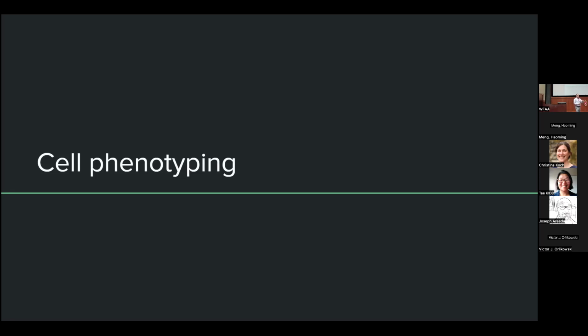And now I'm going to describe one experiment that is still ongoing for cell phenotyping. Cell phenotyping is the second part of the problem. If you remember, in our workflow, we started with cell segmentation, and then we do cell phenotyping or feature extraction, which actually aims to answer the question of how different two phenotypes are when we have one treatment or another.